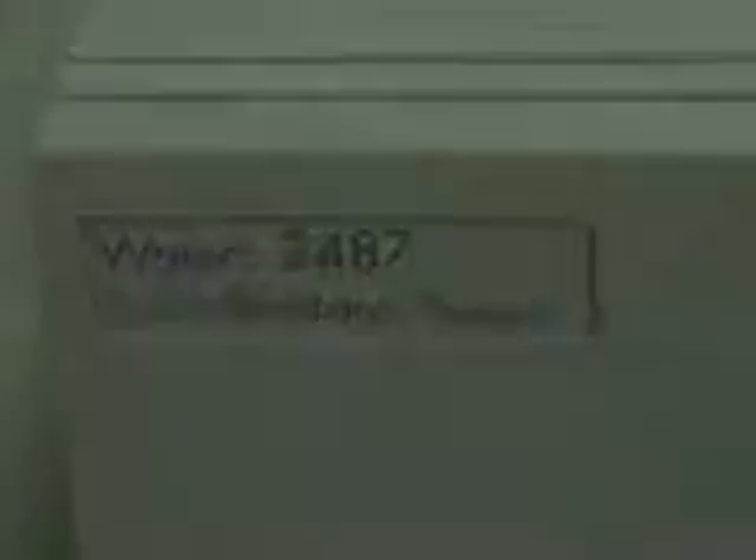Hi, this is Michael Natow from Hitech Trader. This is the Waters 2487 Absorbance Detector.